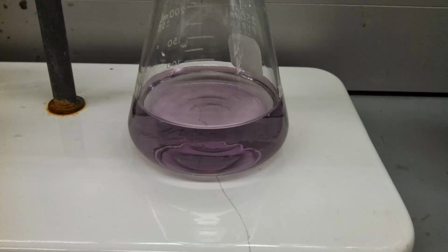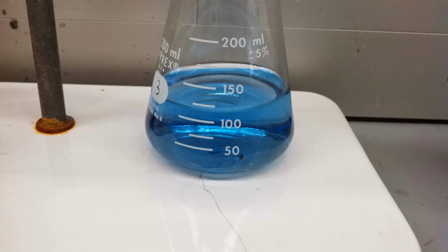And a lot of people like to stop here. They say, okay, there's no more red, it's done. This is not what the endpoint of your titration looks like. If you can see purple, that means there's still red in there. What you want is blue, the total absence of red. I know that this is a difficult thing to see, but now you have a picture of it. Hopefully you'll be able to evaluate this better while you're in lab.